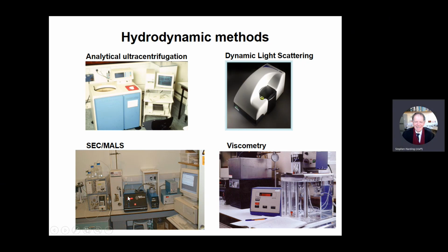There's classical light scattering, multi-angle light scattering, where we look at the scattered intensity envelope as a function of angle, formed by macromolecule scattering in solution at different concentrations. And by looking at the scattering patterns at different concentrations, different angles, we can get information about the molecular weight and conformation of a molecule, similar to what we can do with the ultracentrifuge.